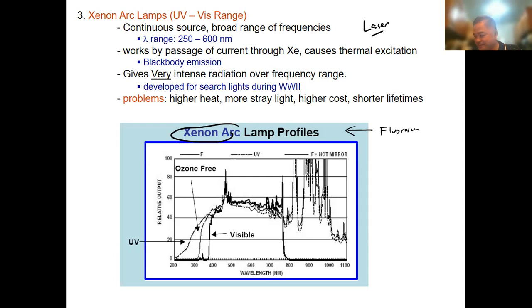I think in the Desamero group, when I was working there, we had a 488 nanometer laser and a 532 laser. And then he bought another one that he made at a lower wavelength. Okay. So the xenon arc lamp, this is the good thing: it can cover the UV region.